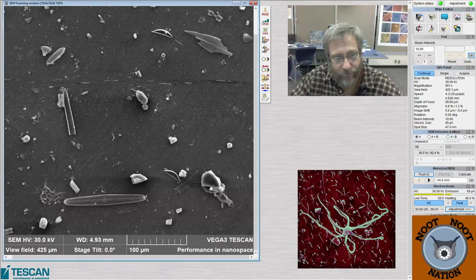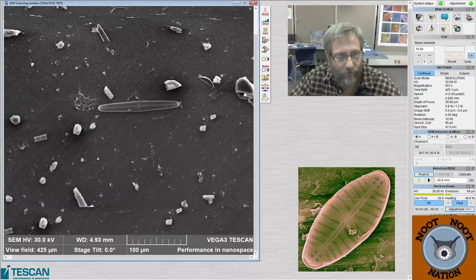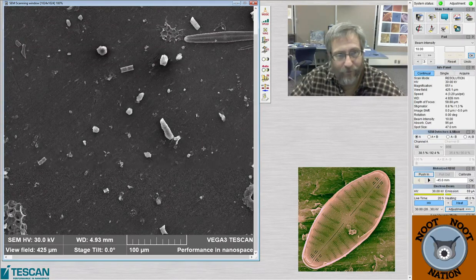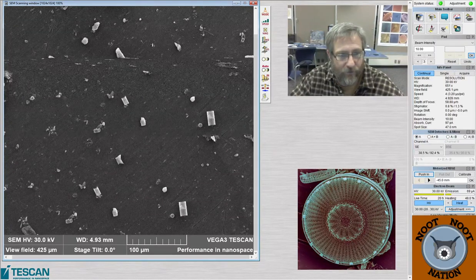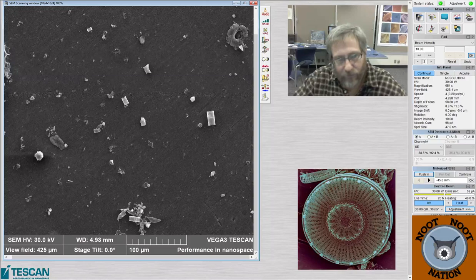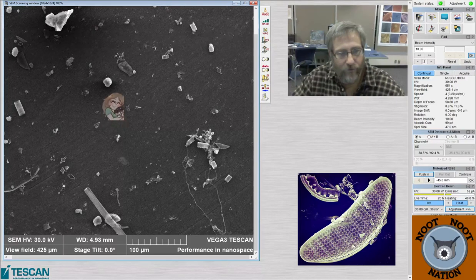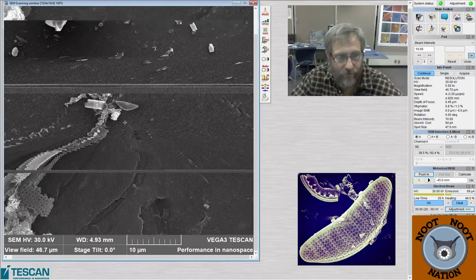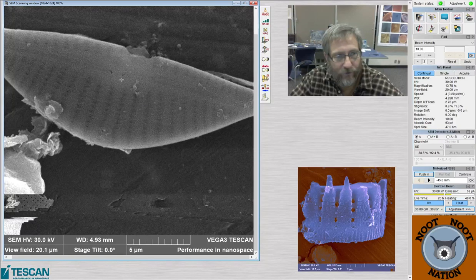I'm not an expert at the photogrammetry software, but I can kind of explain the part that I was responsible for. And it's similar, if you know anything about photogrammetry, it's a similar process no matter what tool you use. The idea is basically you take pictures from all different angles, and then it uses context from one shot to the next to basically place the object into 3D space. So it's kind of neat.